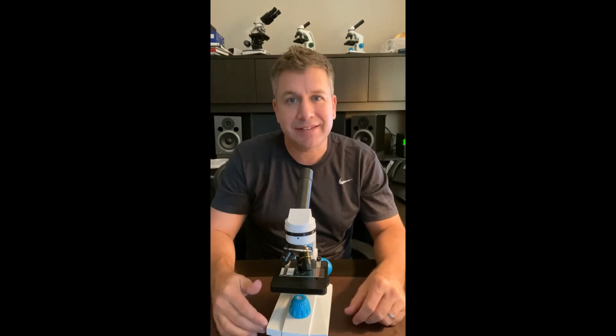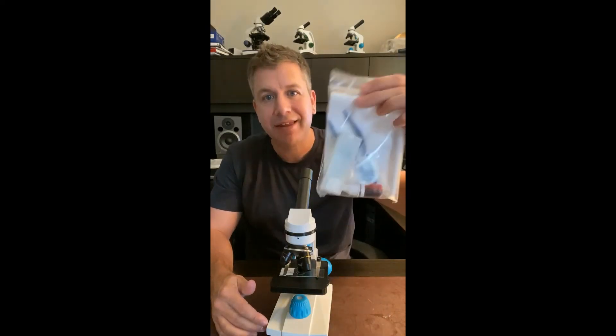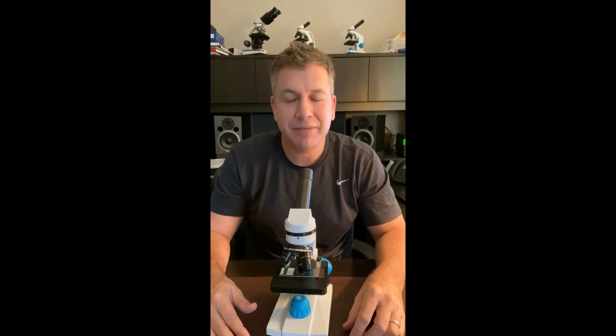That's it for the basics. It's really easy. Just find anything in your backyard — you can use the included kit and create all the slides you need, as well as all the experiment cards that came with it. Again, I'm Bill Evans from Microscope.com. Thank you for buying the Junior Scope. If you have any issues, reach out to us.